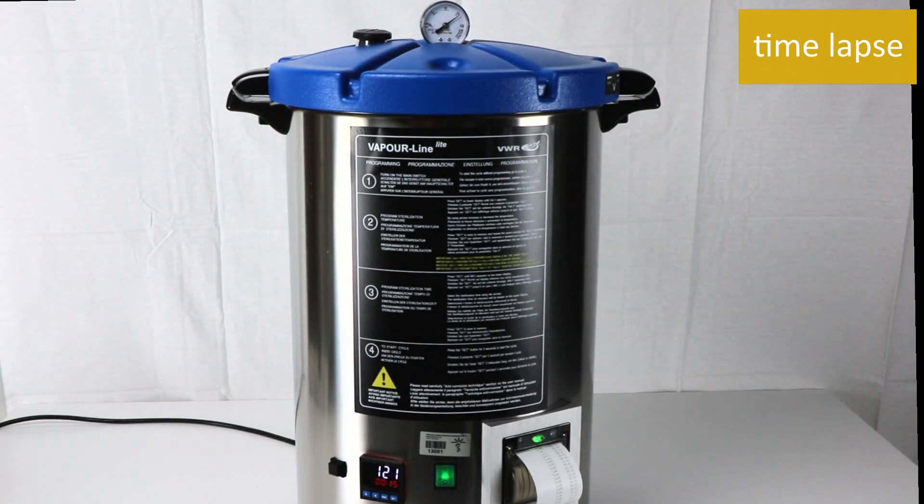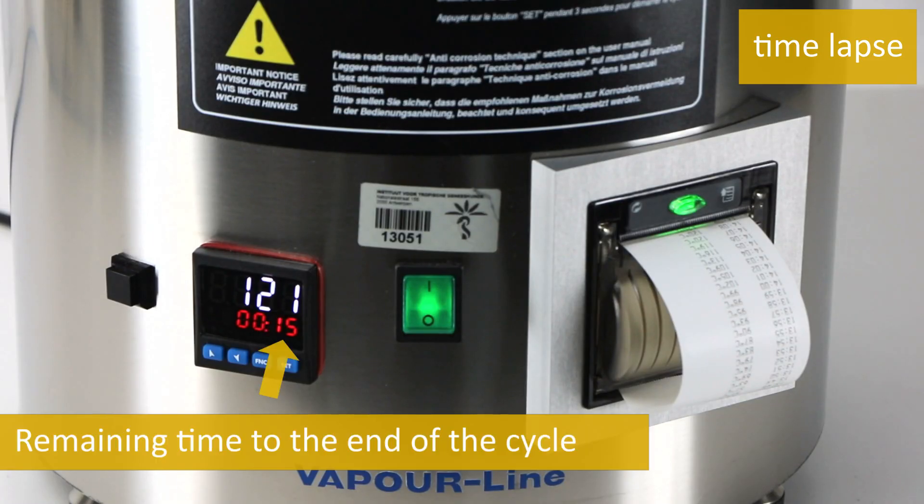When the sterilization temperature is reached, the lower display shows the time left to the end of the sterilization cycle.